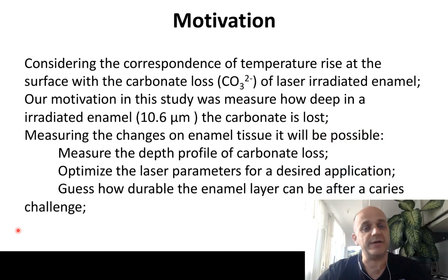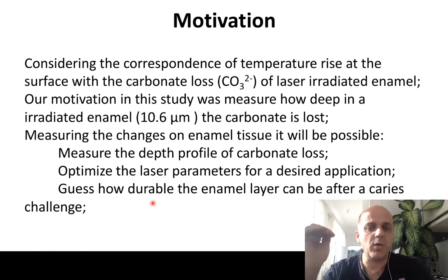Considering that there is a correspondence between the temperature rise on the surface and the carbonate loss in irradiated enamel, our motivation in the study was to measure how deep this change happens in the irradiated enamel. For this we can measure the carbonate loss, and then measure the depth profile of this carbonate loss after irradiating this enamel with a wavelength of 10.6 micrometers. By measuring these changes in this tissue, it is possible to measure the depth profile of the carbonate loss first, and you can optimize the laser parameters for the desired application.